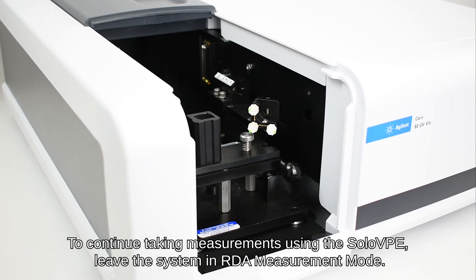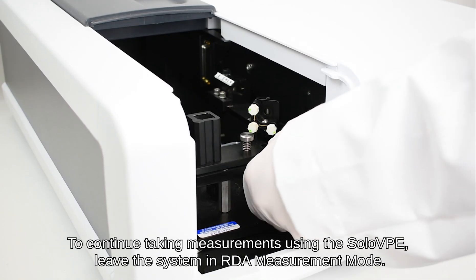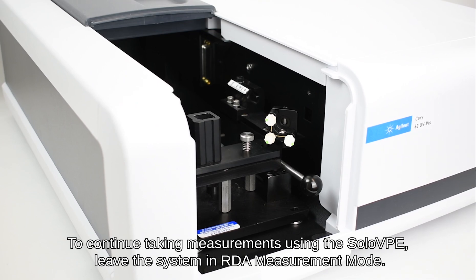To continue taking measurements using the Solo VPE, leave the system in RDA measurement mode.